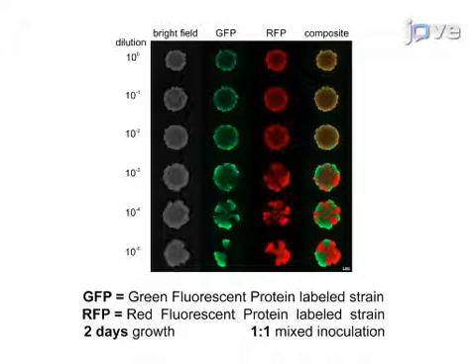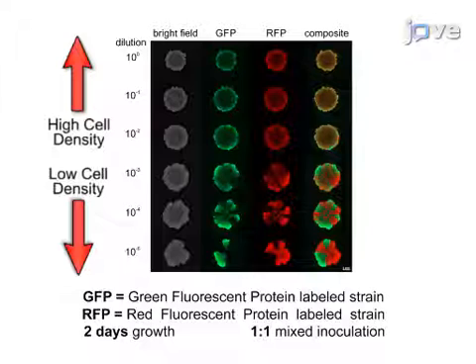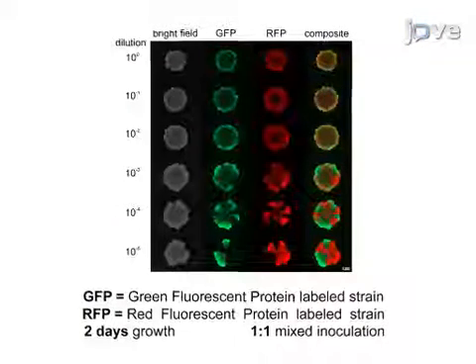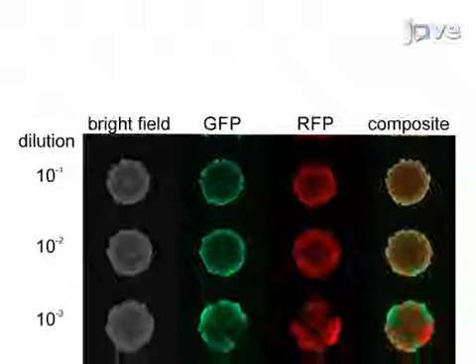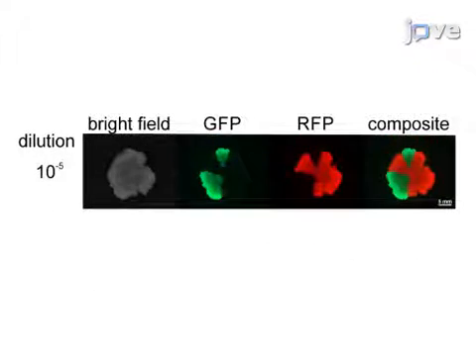In biofilm-producing colonies, starting cell densities heavily influenced the spatial assortment of the resulting colonies. Colonies initiated with high cell density of the mixed populations showed minor or no spatial assortment. In contrast, when cell density at initiation was low, clear green and red fluorescence sectors could be detected.